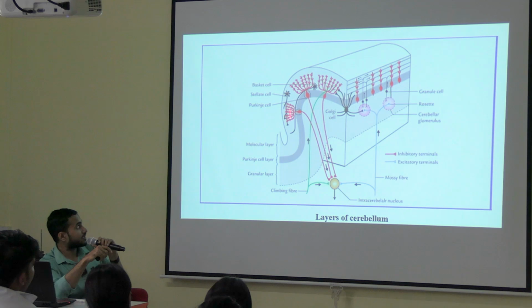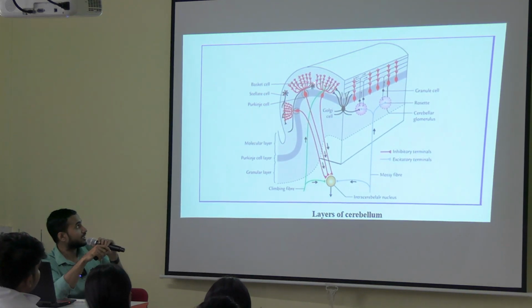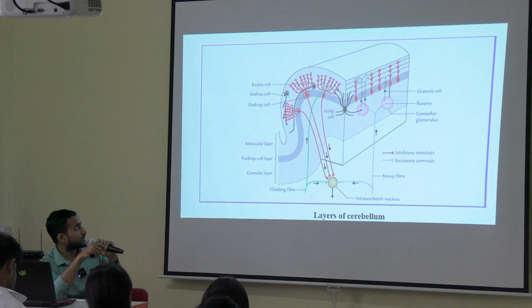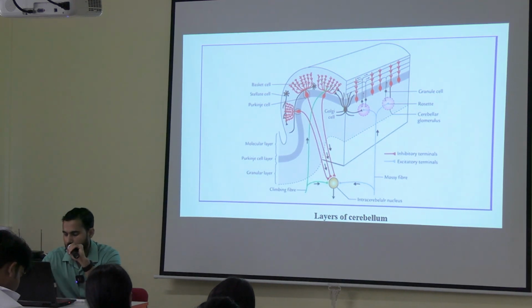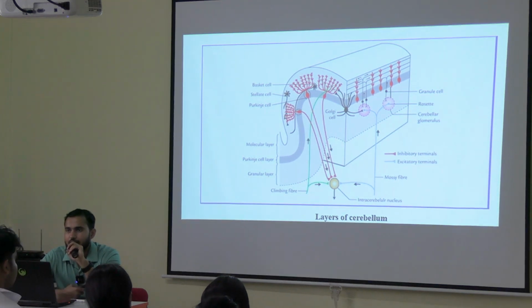As you can see, this is the first layer. These are the superficial stellate cells, and these are the basket cells. You can see all the different types of fibers present in this layer. That's why this layer appears brighter, with an eosinophilic appearance.